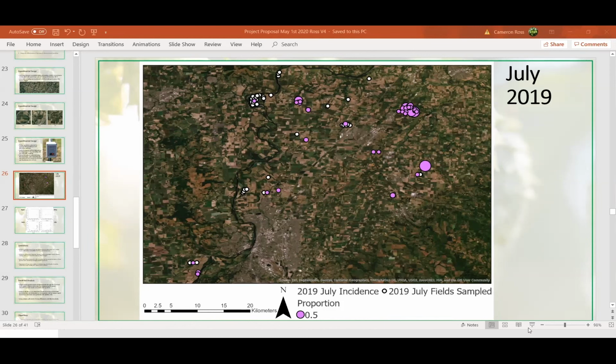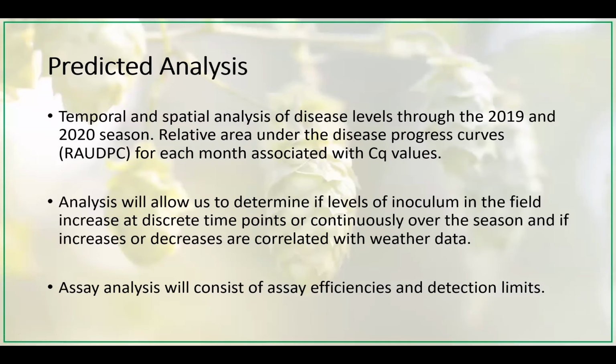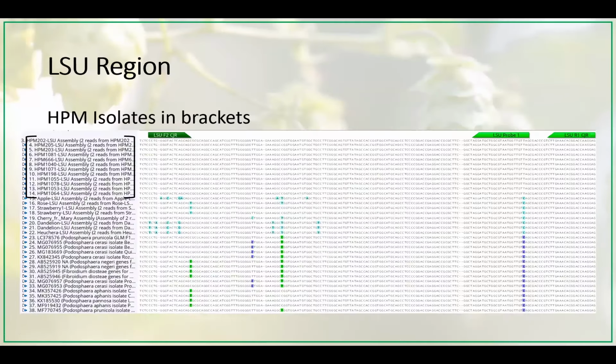Cameron, this is Joey. Hey, Joey. On your qPCR primer that you're designing for the large subunit. Yes. And you were showing that 1 point mutation that differentiated your species. Yeah, this one right here. When you're designing that probe, that primer, have you designed kind of like a sliding window approach, where you're designing up and down the length of that sequence, trying to find where maybe the most vulnerable position is to disrupt that priming?